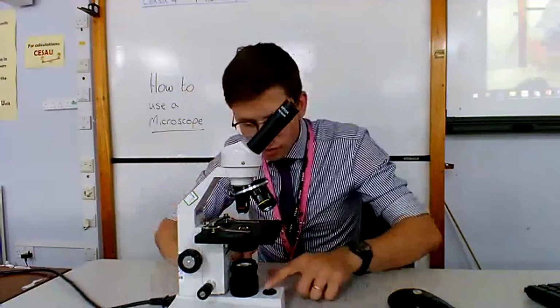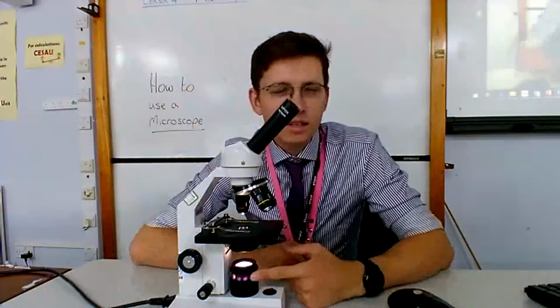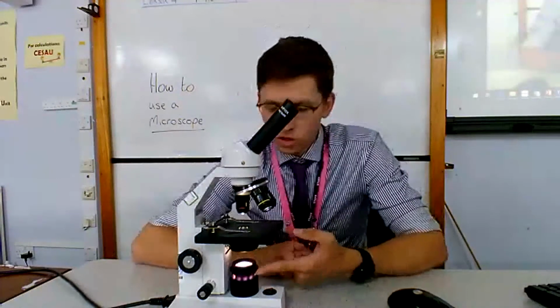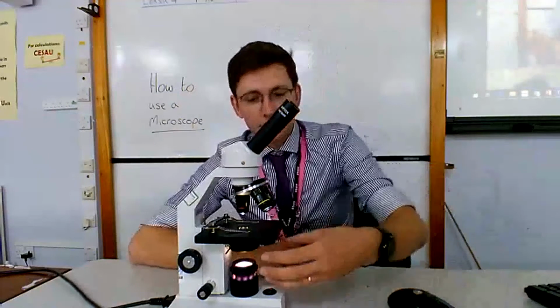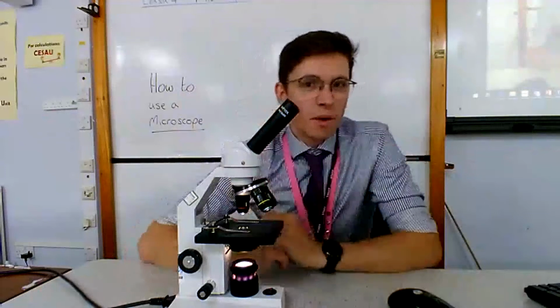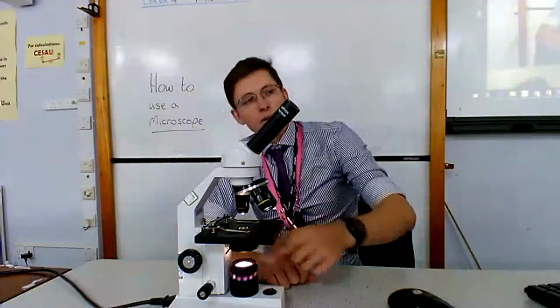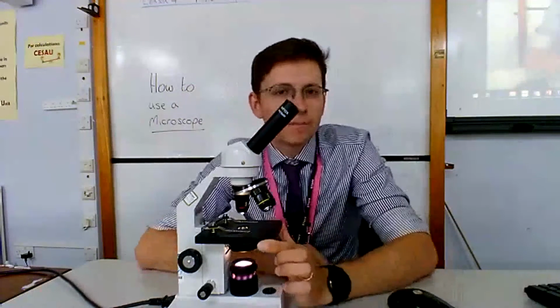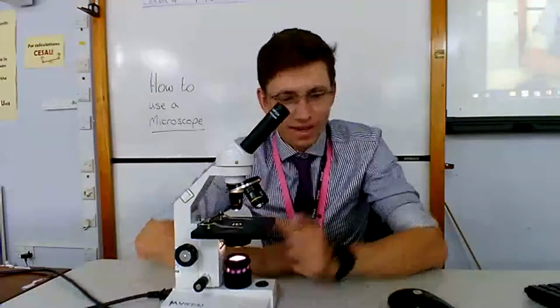When we look through then, we've already found the light that's down the bottom here. So that's the light. You can either have an electric microscope where you get the light as a torch, or you can get a mirror and you might have to shine a lamp on the side and then direct the light up using the reflection from the mirror. But both work really well. And that shines a light up through this big thing here that's called the stage. Okay, this stage is where we're going to put our specimen so we can see it.